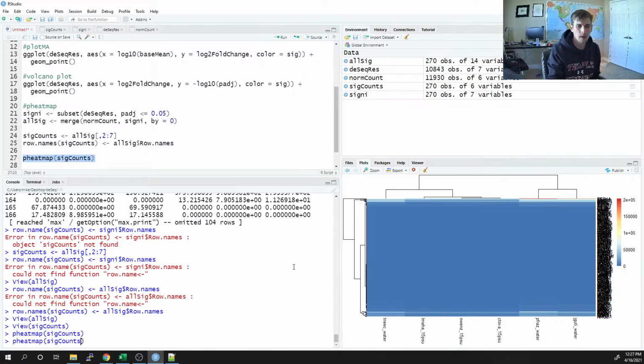We can address that one step further by normalizing this read count data. We can normalize using a log2, which is a really common way. It lets us look at the exponents instead of the raw numbers, how the fold changes. So I'm going to look at the log2 of this. And if I do just a log2, I'm probably going to get grumpy.